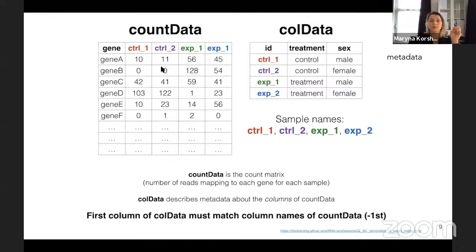However, you can also include different metadata in there. Sometimes you do not operate with just one sample. Your experiment usually is much more complicated, and that is why you have to include different metadata to perform the processing and data comparison further.